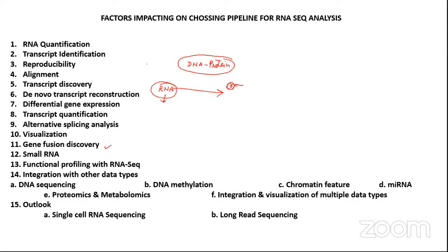Integration with other data types. This RNA expression I can integrate with my methylation data, with my ChIP-seq data, with the single cell data, and with the metabolomic data.